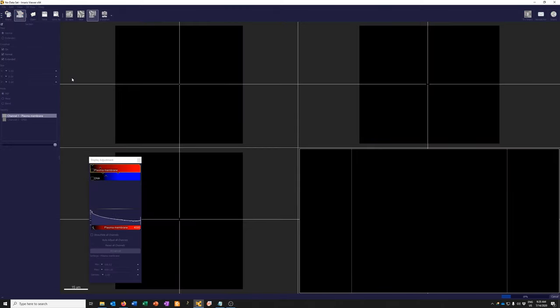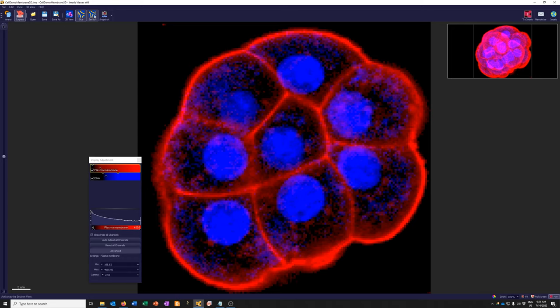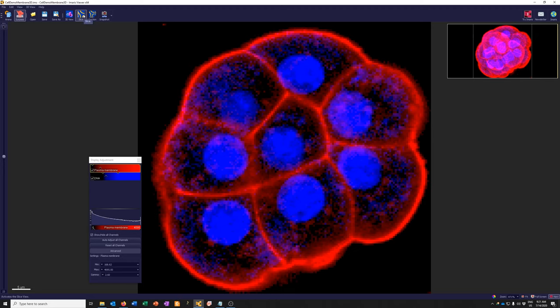Let's look at the 'Cell Demo Membrane 3D' data set. I'll double-click here, and once we're in Surpass mode — which is how you visualize data — we now have three different display modes: 3D view, where you see things in 3D; slice view, where you see individual slices; and sections, where you see side views. We're going to start with slice view because you can do a lot here, and it's easier to explain some basic things about the software in this display mode.